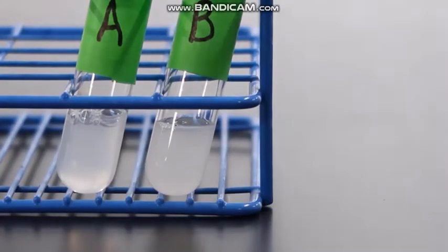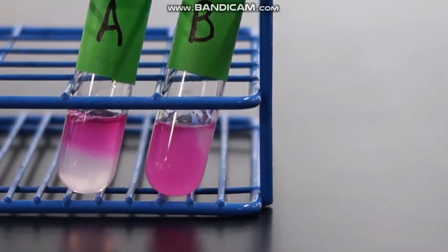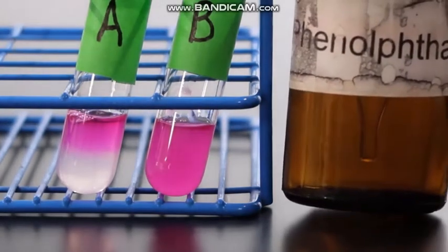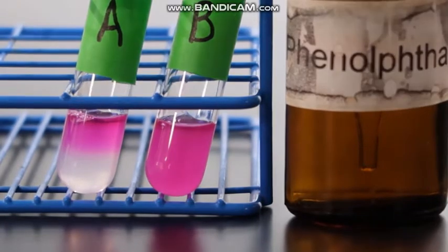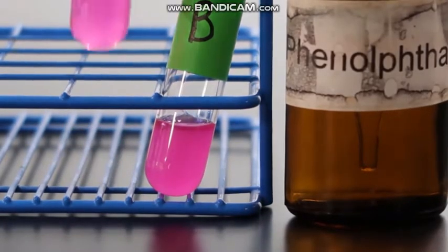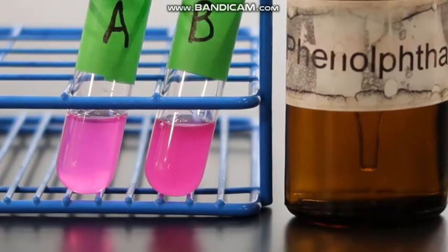The first property we want to explore is that of pH. To each test tube, I am adding a little bit of phenolphthalein. Phenolphthalein is an acid-base indicator that lets us know whether or not something is acidic or basic. When it's pink, we see that the solution is more basic. If it were to be clear, we would say that the solution is more acidic.